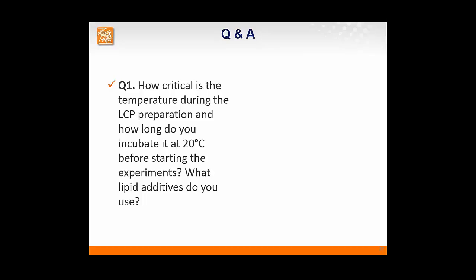I'm now continuing to the question and answer session. So these are the questions that were submitted by the viewers of this webinar. The first question is, how critical is the temperature during the LCP preparation, and how long do you incubate it at 20 degrees before starting the experiments? And what lipid additives do you use?